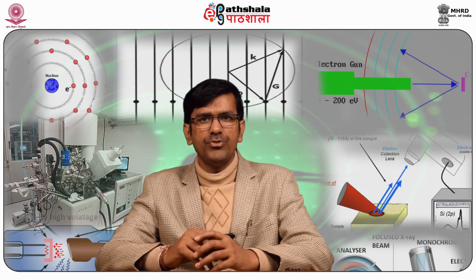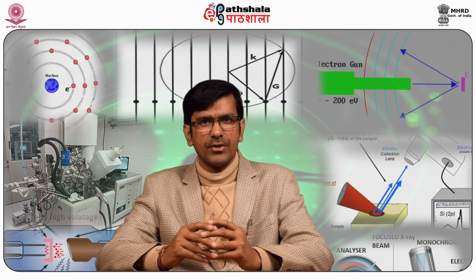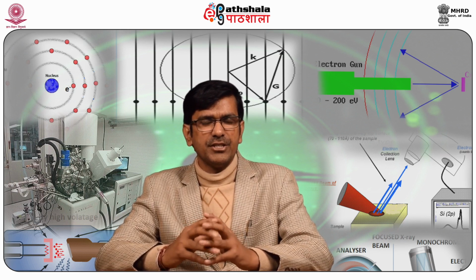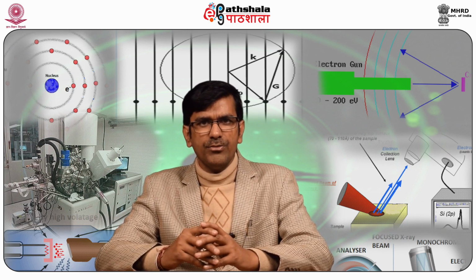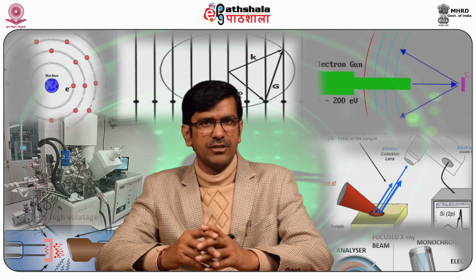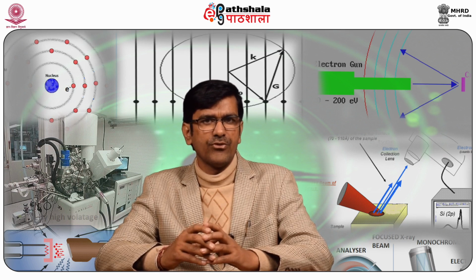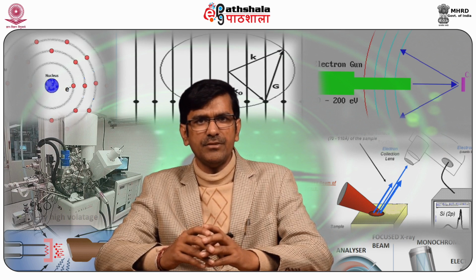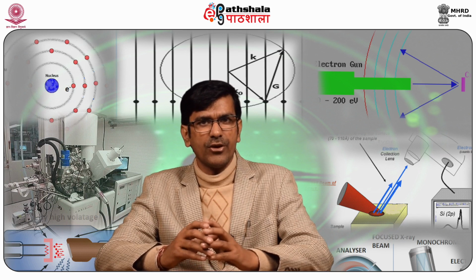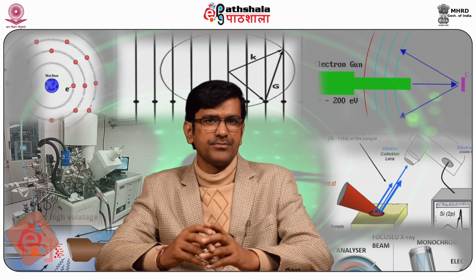Steps can be taken to improve the resolution, but this in turn affects the sensitivity. High resolution always comes at the expense of signal intensity. One resolution improving technique that then messes with the sensitivity is changing the width of the entrance and/or the exit slits. For example, in an SDA, these slits are what define the range of trajectories photoelectrons may have when entering or exiting the analyzer.